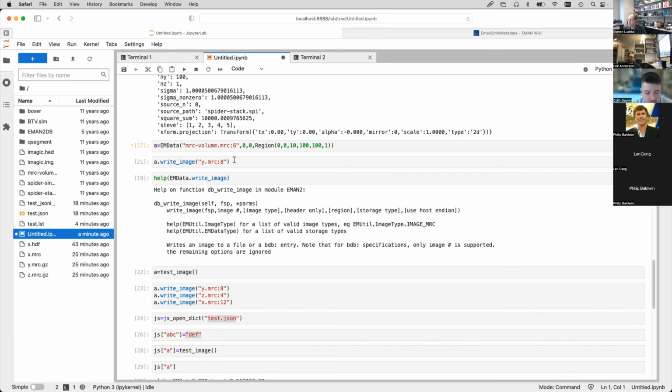I do have a slightly technical question. Sure. How do I call EMAN2 from a Python script if it's installed in Conda? Do I have to activate the Conda environment first, or is there a way to just grab the Python libraries? Yeah, the Anaconda environment has to be active for you to use EMAN2 Python scripts. Otherwise you won't get all the right dependencies.